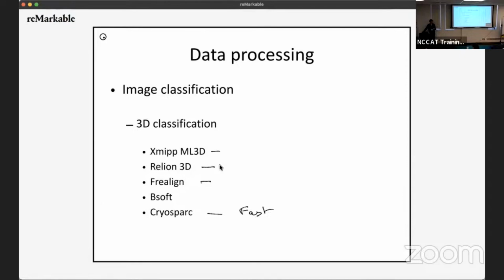And so you can definitely, because CryoSPARC is fast, if you know there is variability somewhere that's important, you can break down into 3 good references and 5 bad, and it's going to work just fine. You can do that. You cannot do that in Relion.